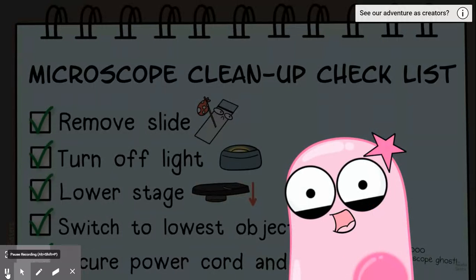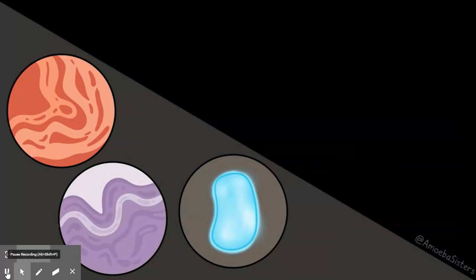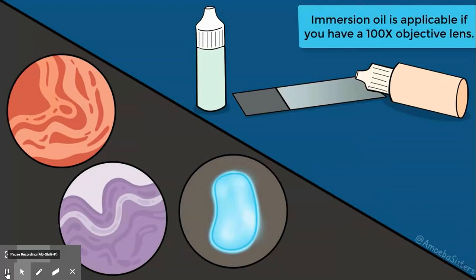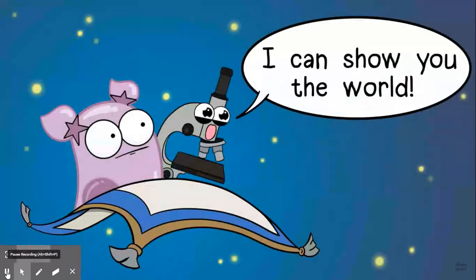Keep in mind there are some techniques to better visualize some specimens, such as using different stains or using immersion oil at highest magnification to increase resolution. Definitely something to explore that this video doesn't go into. Microscopes open up an entire world that you can't see with the naked eye.